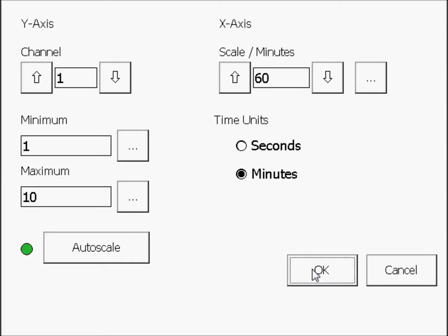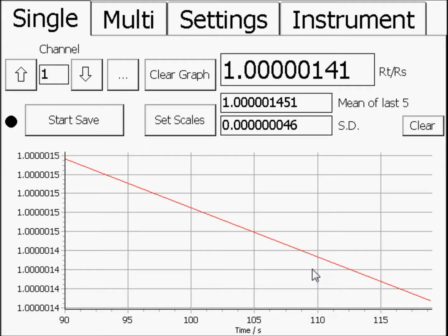Press OK to return to the main window. The measurement system will now accumulate data and after 60 minutes the graph will begin to scroll to show the last 60 minutes of data recorded.